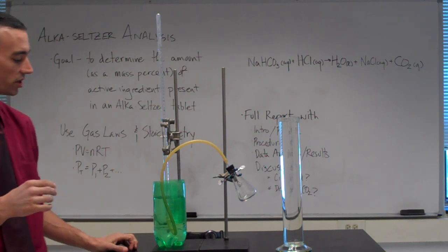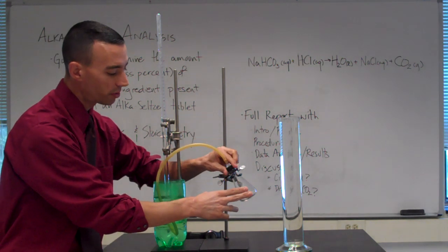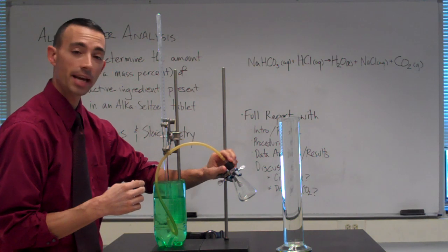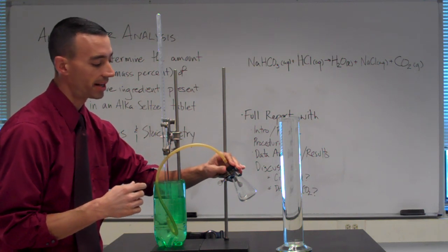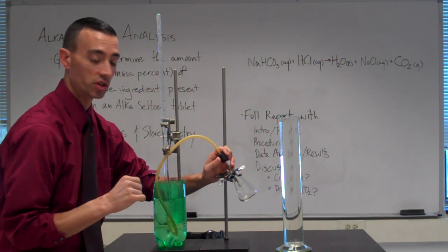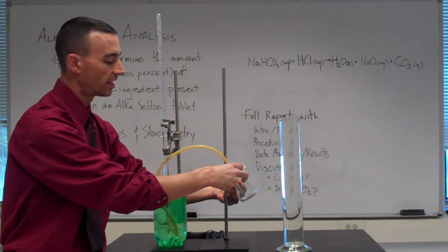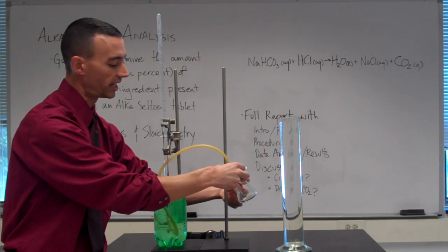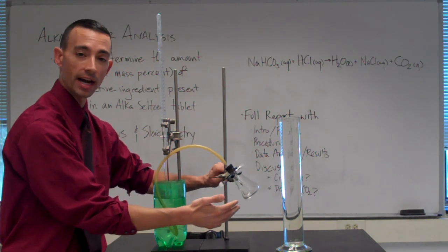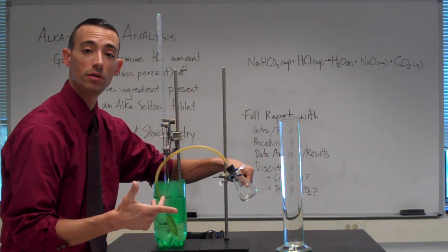So it'd be best if you washed your hands. In the reaction chamber, you'll place some hydrochloric acid, and then you will prepare your samples of sodium bicarbonate or Alka Seltzer in a small gel capsule that you can add into the chamber and then quickly close it off. You'll want to agitate the chamber. It's really easy if you just loosen the clamp a little bit, and then you can shake it, rock it back and forth gently to help dissolve the gel capsule.